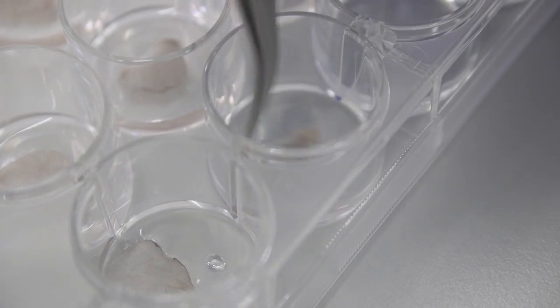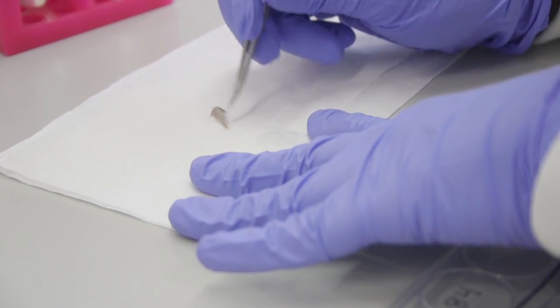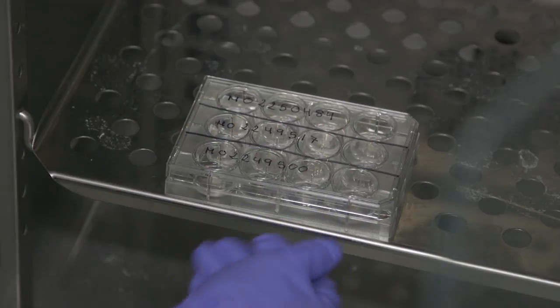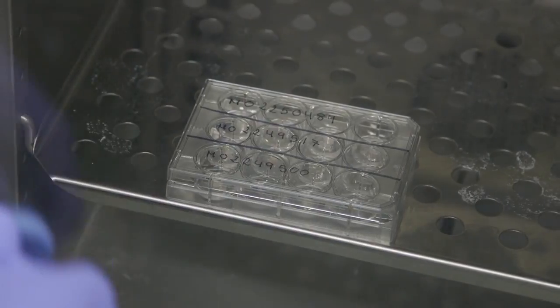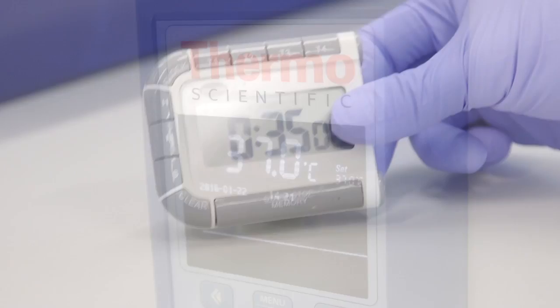If the ear half is placed the wrong way up, it will likely sink. If this happens, the ear should be dried off and placed back onto the ammonium thiocyanate the correct way up. Once all samples have been transferred to the plate, it should be incubated at 37 degrees Celsius for 35 minutes.